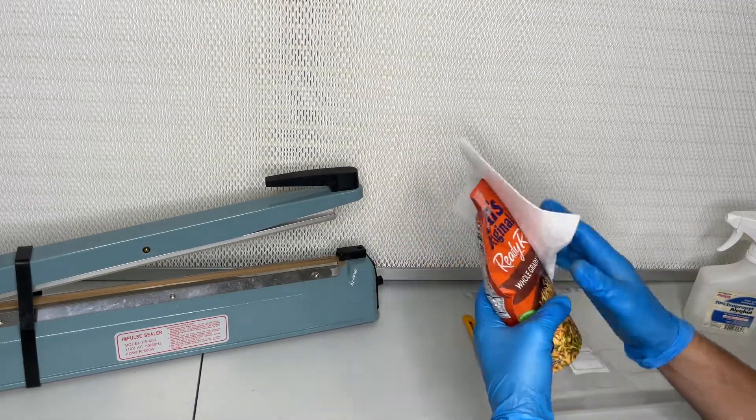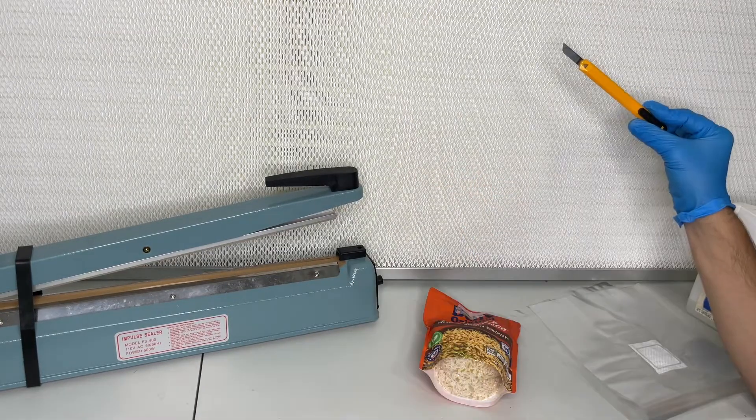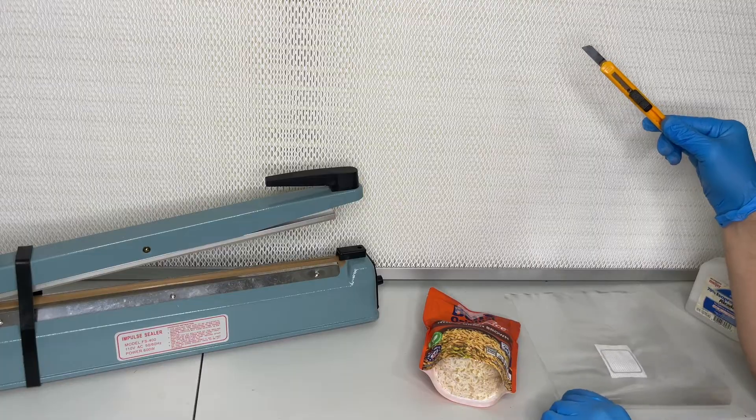It is now removed from the package with a flame sterilized scalpel, placed inside of a filter patch bag, and sealed with an impulse sealer.